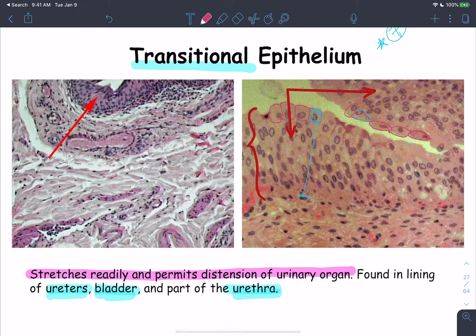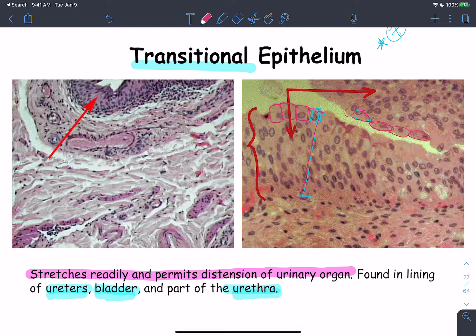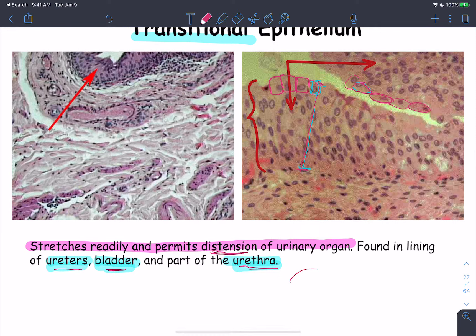Another epithelium type shows many cell layers, suggesting stratified. The apical cells look cuboidal, but some are squamous. This epithelium is located in the urinary tract — the urinary bladder and urethra — and its main function is to allow stretch and distension of the urinary organs to accommodate urine. This stretch causes the transformation of cuboidal cells into squamous cells, which is why it's called transitional epithelium.